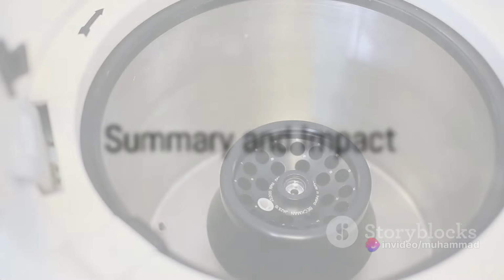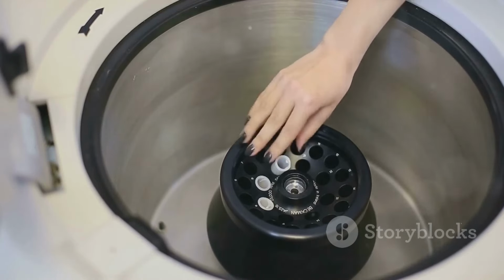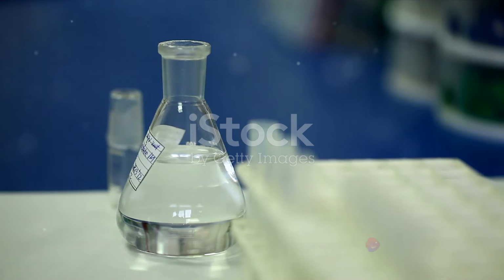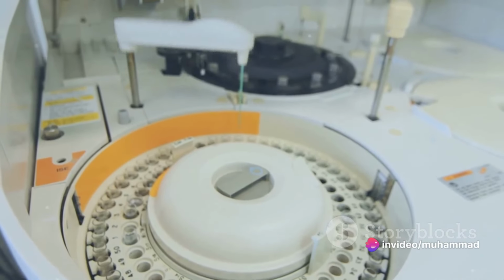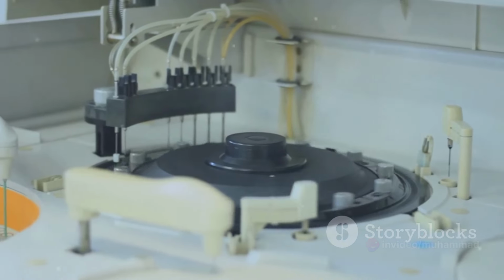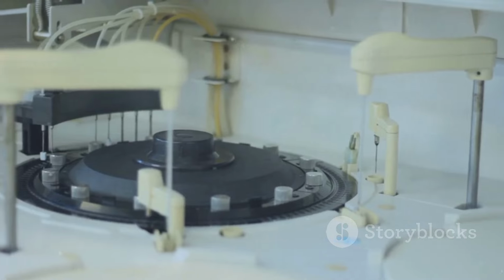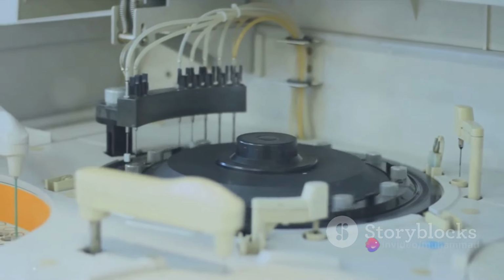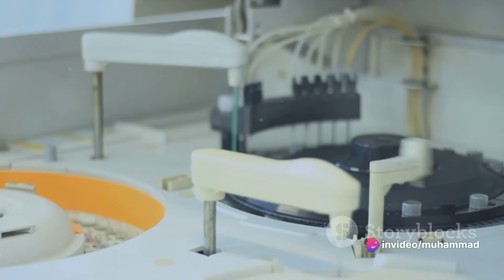In summary, cell fractionation involves 3 key steps: homogenization, differential centrifugation, and density gradient centrifugation. Homogenization breaks down the cells, releasing their contents. Differential centrifugation, with its varying speeds and durations, separates the cellular components based on size and density. Lastly, density gradient centrifugation fine-tunes this separation, allowing scientists to study the closely related components individually.